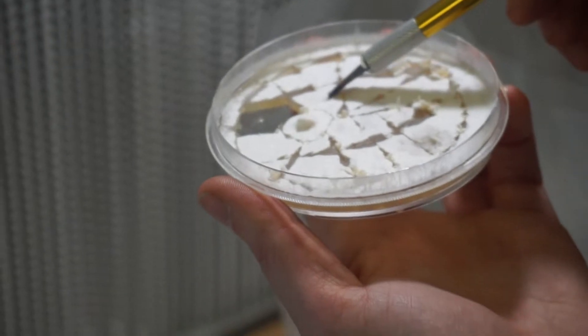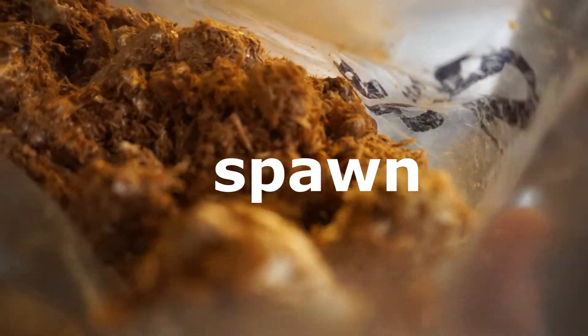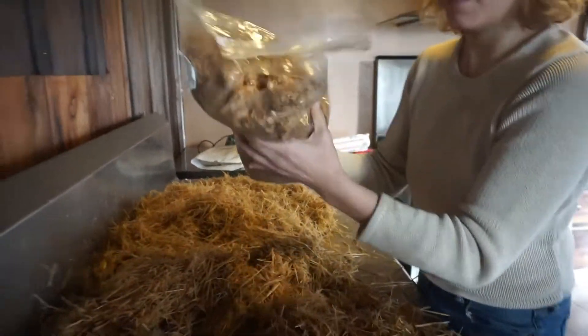Once it is grown out, you take pieces of these and put them in a grain. Then you wait for the grain to become covered in mycelium. Now you have what is called spawn, which is like having a concentrated bunch of mushroom pieces to spread like seeds.